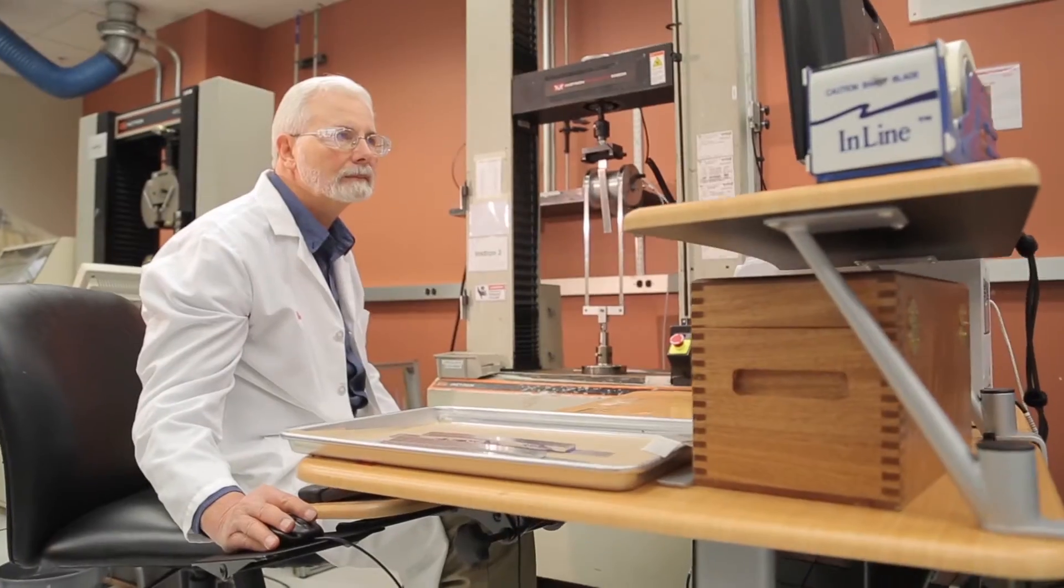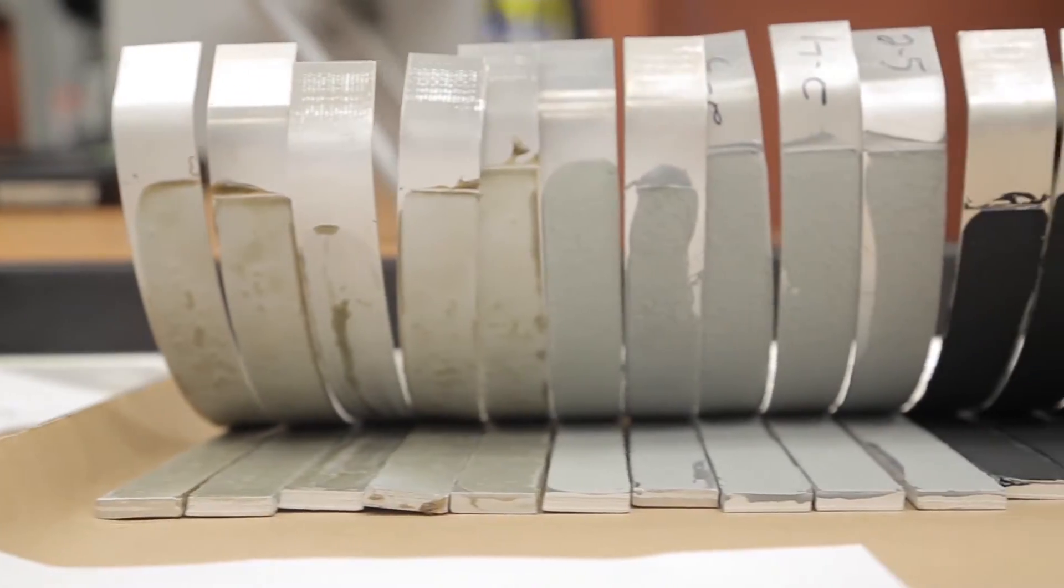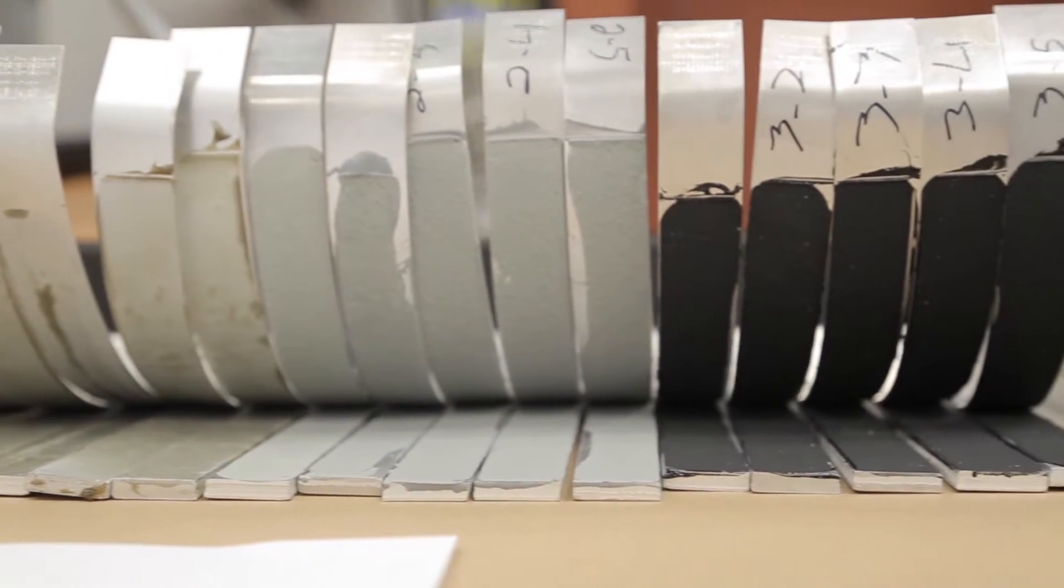The test can be run using only the flexible substrate and this value is subtracted from the combined result to provide the peel strength of the adhesive alone.